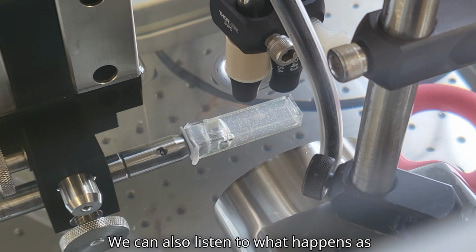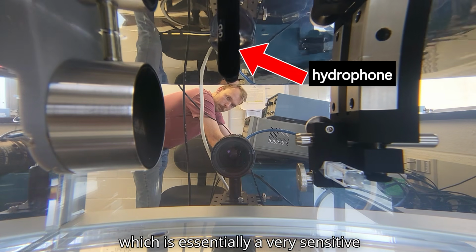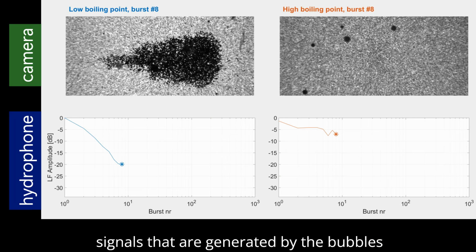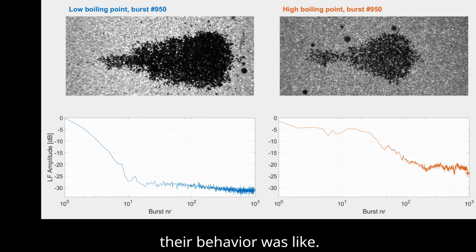We can also listen to what happens as ultrasound waves hit the droplet and form a bubble. We do this by using a hydrophone, which is essentially a very sensitive underwater microphone. This hydrophone picks up the acoustical signals that are generated by the bubbles as they form and also as they collapse. And this gives us very valuable information about what their behavior was like.